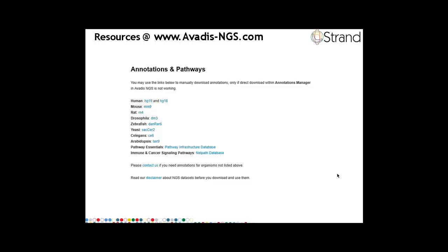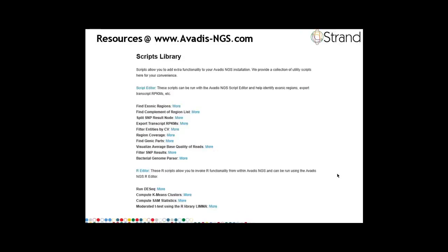We also provide pathway interaction databases for human, mouse, rat, Drosophila, zebrafish, yeast, C. elegans, and Arabidopsis. The Avadis NGS tool's functionality can be extended through custom scripts that we can provide if there is a need. Scripts which have been found useful by multiple customers are put up on the scripts library on our website.